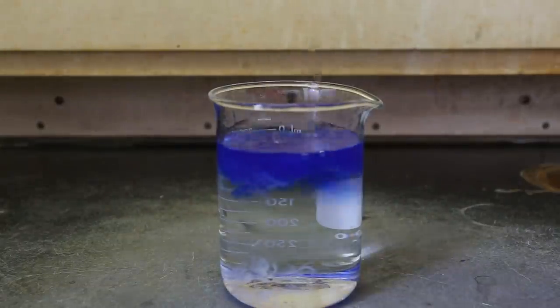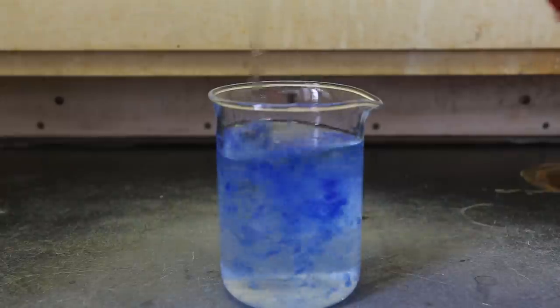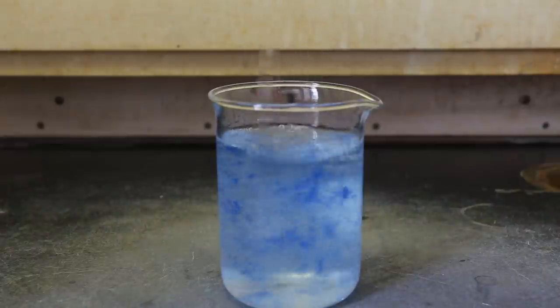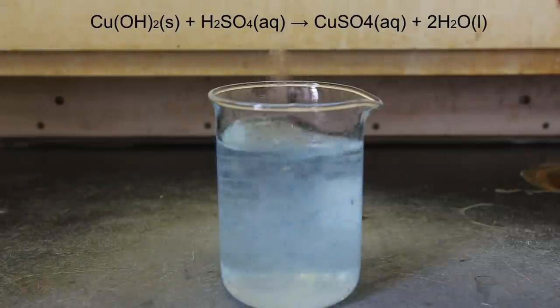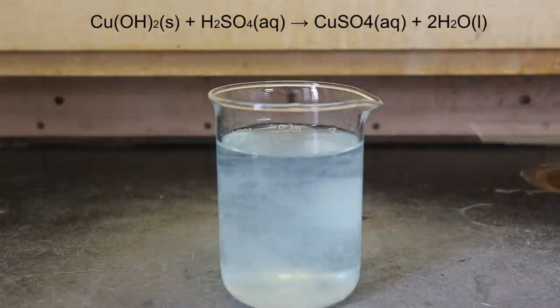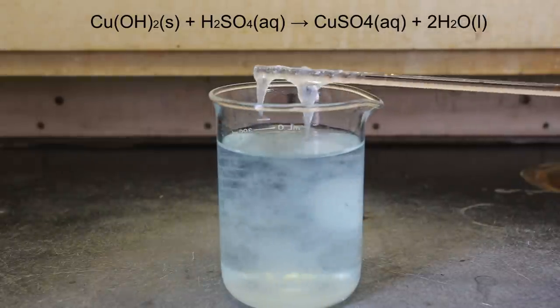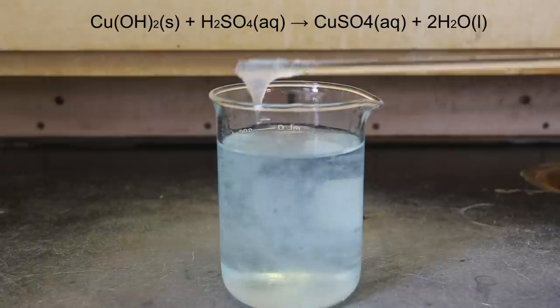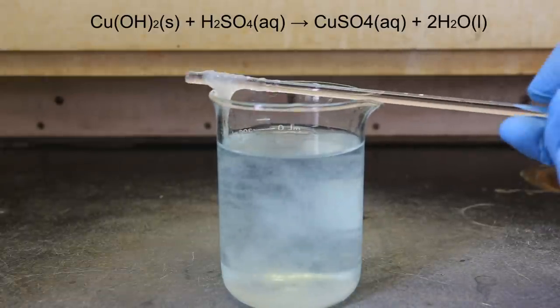Upon thorough mixing, the dark blue color of the Schweizer reagent disappears. Eventually, the cotton becomes completely white and the solution takes on a very slight blue color. The sulfuric acid reacts with the ammonia hydroxide and the copper hydroxide according to the reaction shown above. The reaction between ammonium hydroxide and the sulfuric acid produces ammonium sulfate, which is colorless when dissolved in solution. However, when copper hydroxide reacts with sulfuric acid, it produces copper sulfate, which is a blue color in solution like you saw earlier in the video.